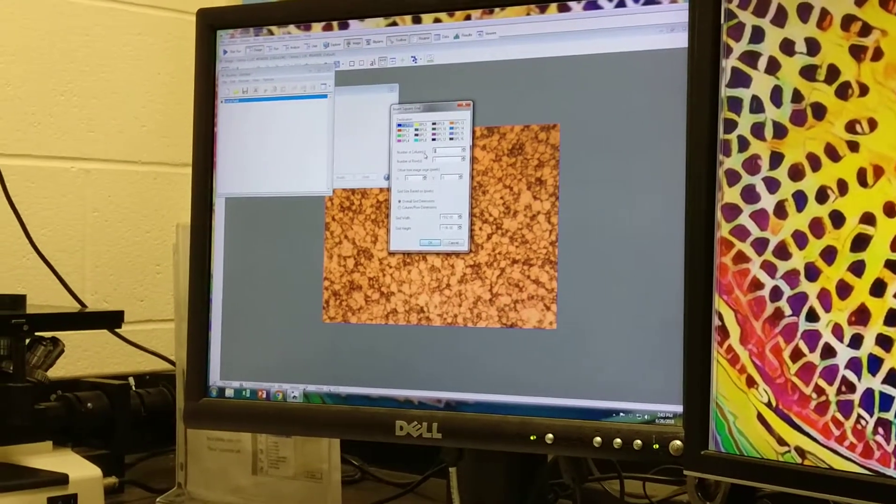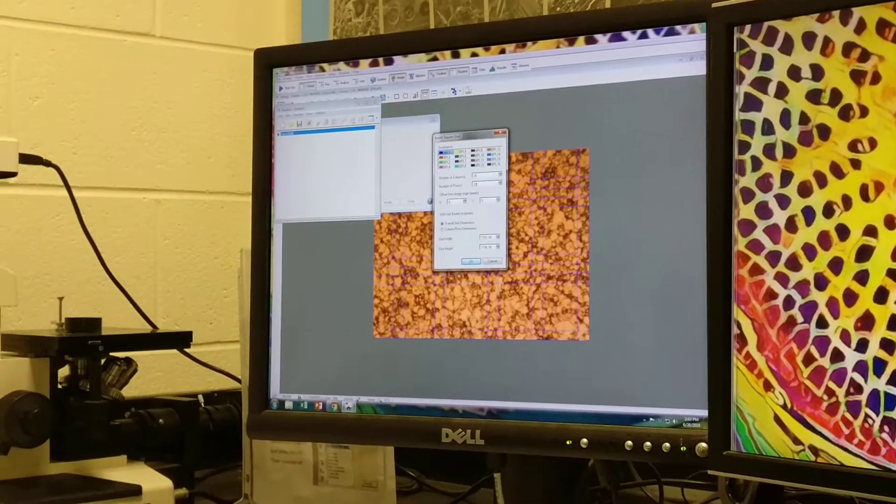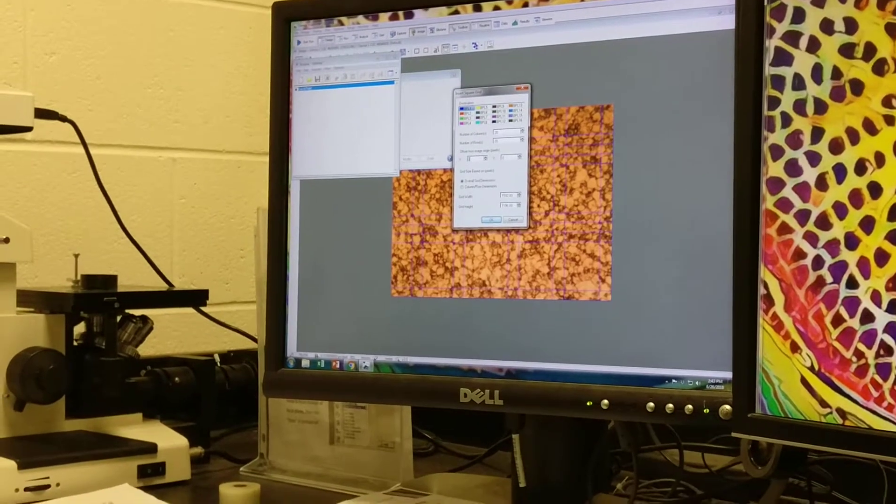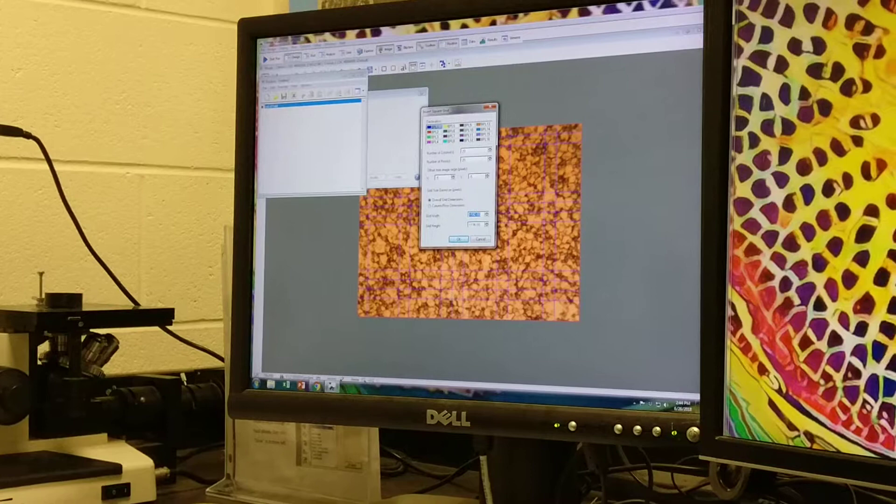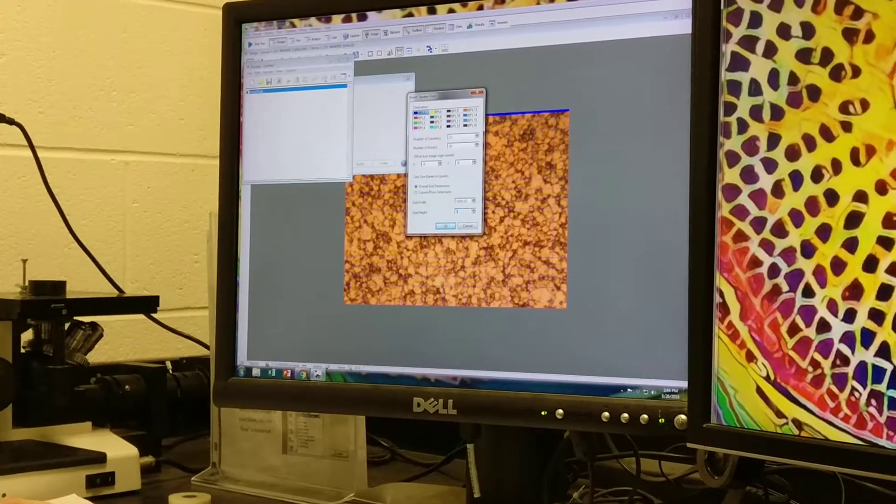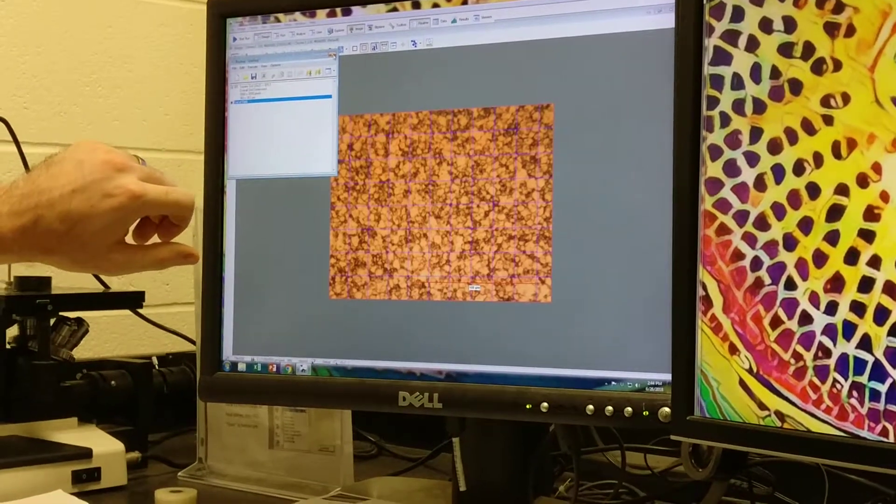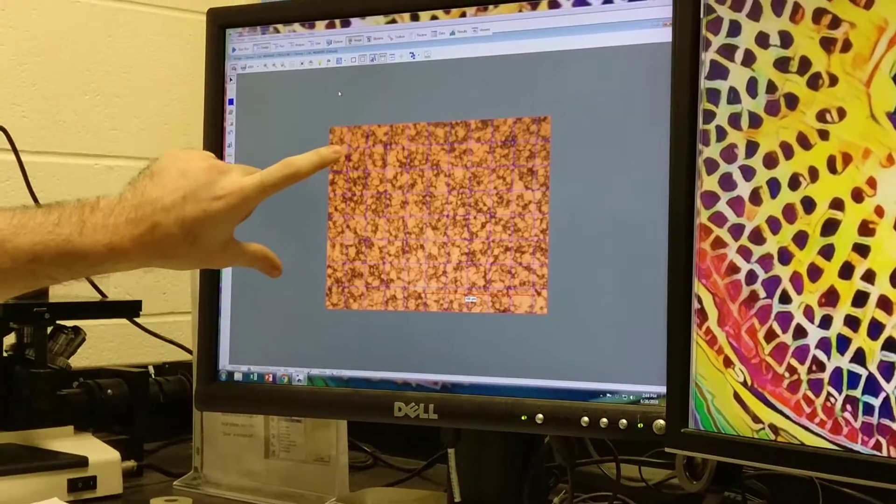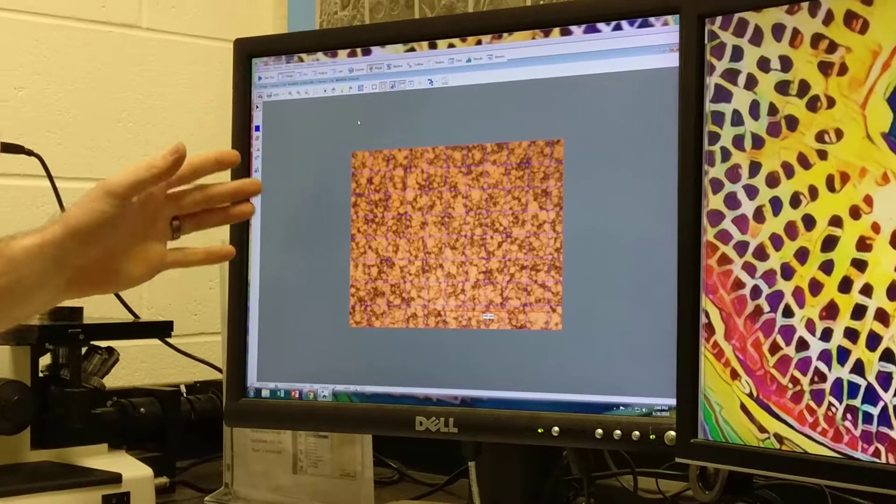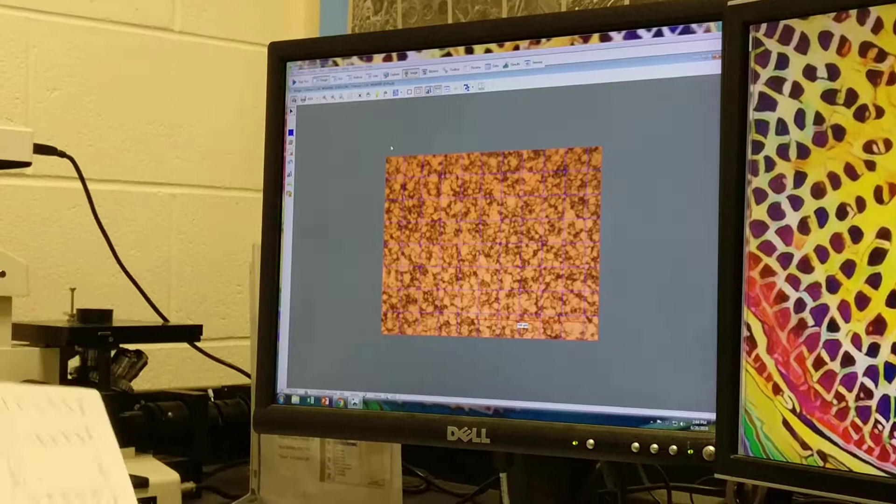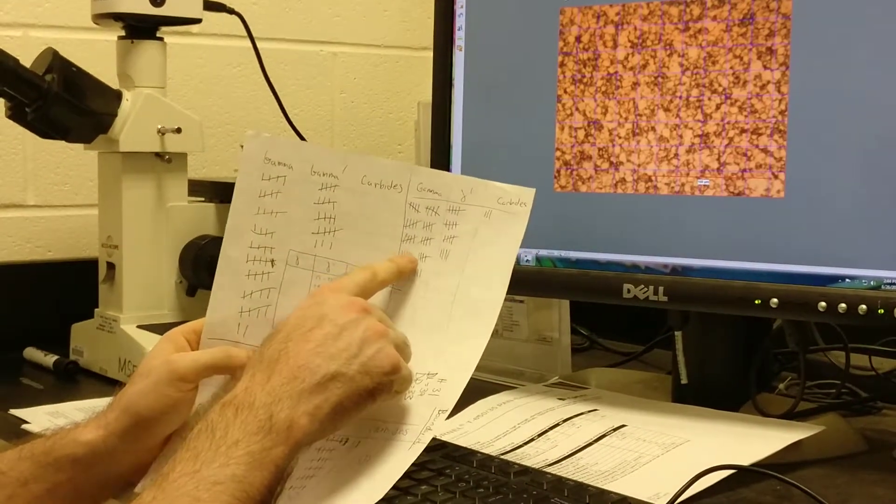Then we're going to put numbers in these boxes. Those numbers are 20 rows, 20 columns, the offset for x is negative 5, offset for y is negative 5, the grid width is 3000, the grid height is 3000. This is going to give us a total of 72 points intersections that we can see.